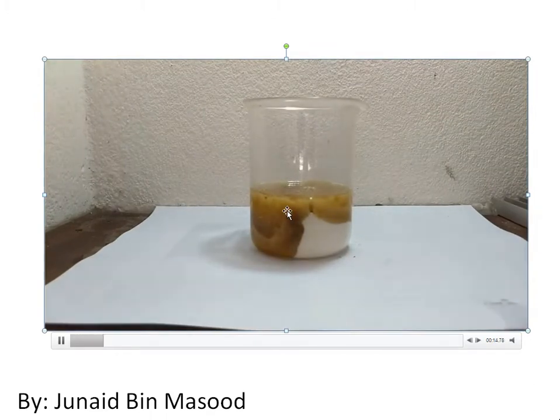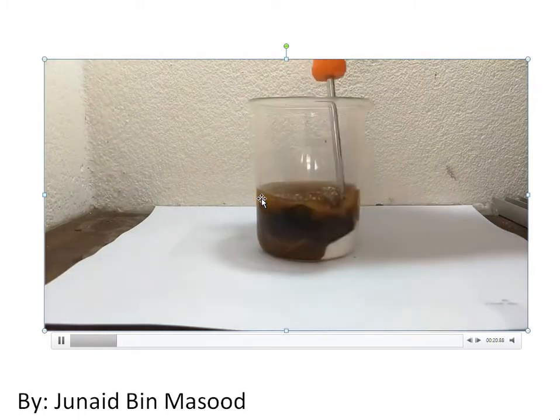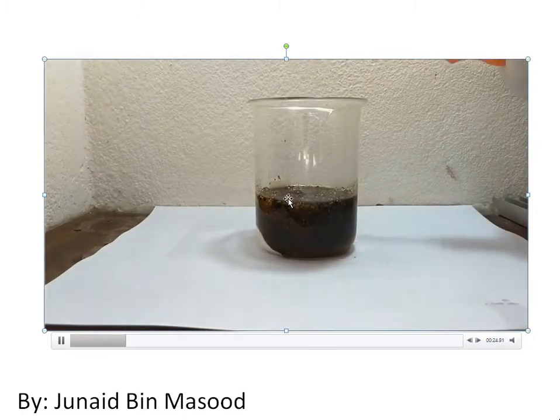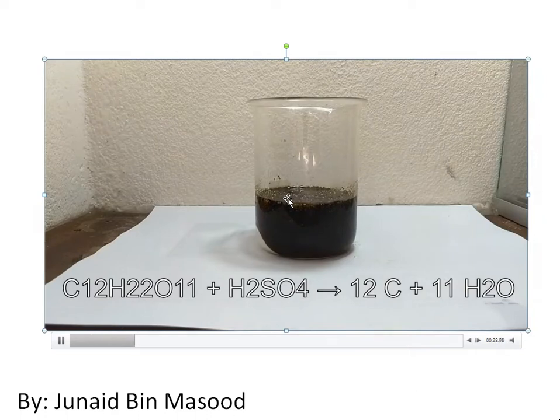Now as you can see, sulfuric acid with sugar is causing the burning, and let's see what happens. We are mixing it, so it caused the sugar to burn, and at the same time when sugar reacted with sulfuric acid, it produces carbon and water, so it burns sugar basically.